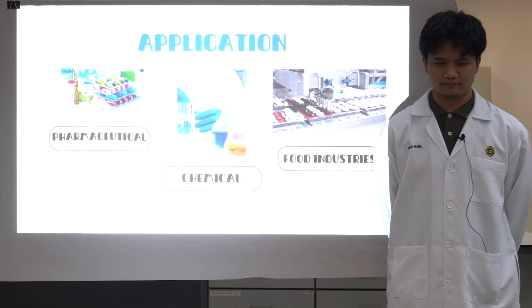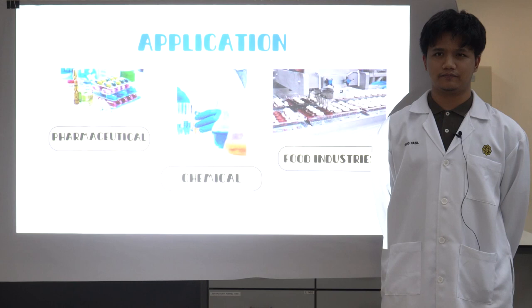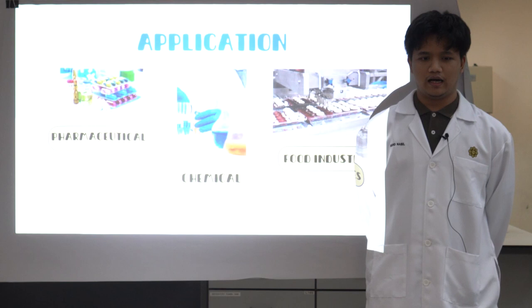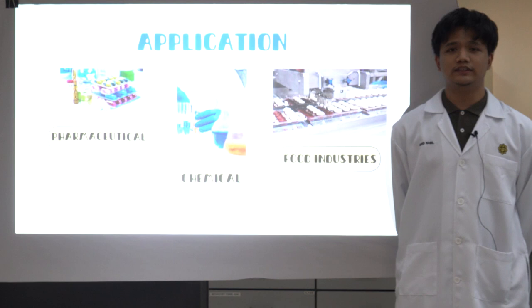This may be contaminated by impurities, by-products, or unreacted starting components from the chemical reaction. These impurities can be separated from the chemical target by recrystallization, producing a product with a greater level of purity.